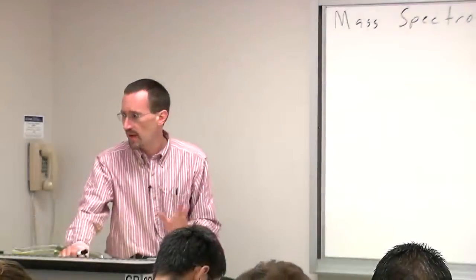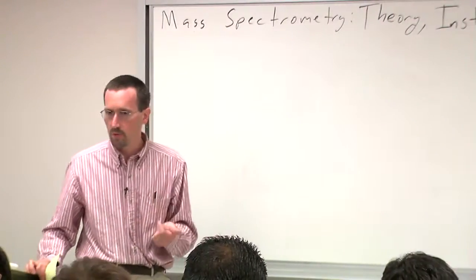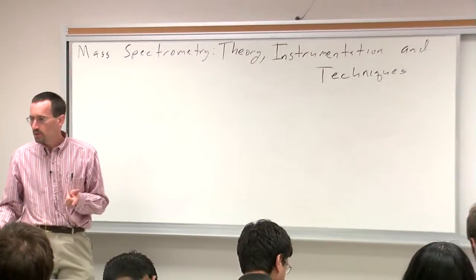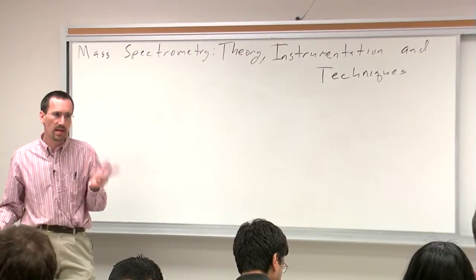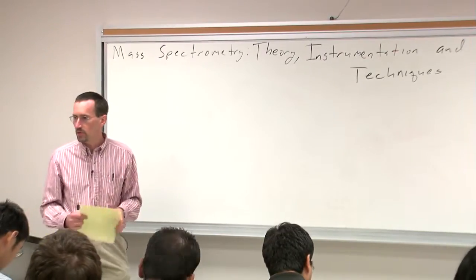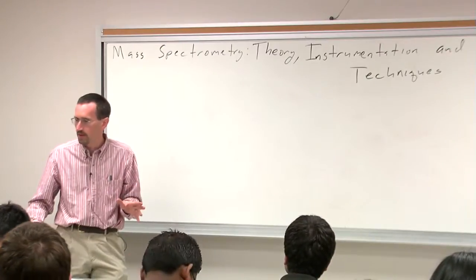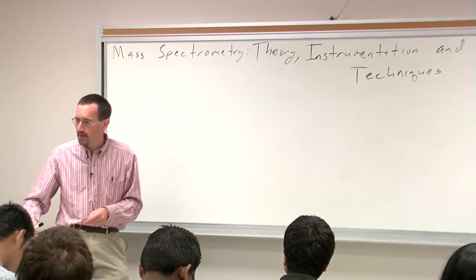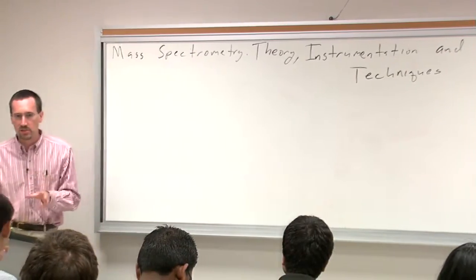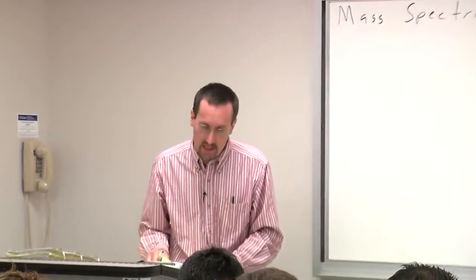To start talking about mass spectrometry, today we're going to talk a little bit about how the technique works. On our next lecture on Monday, we're going to talk about concepts, and then on Wednesday, we'll spend one lecture on EI fragmentation, which is kind of special topics. It used to be really, really central to mass spectrometry. It's sort of part of pedagogy that's carried on, but EI Mass Spec is the historical first in mass spectrometry, but is a lot less important these days.